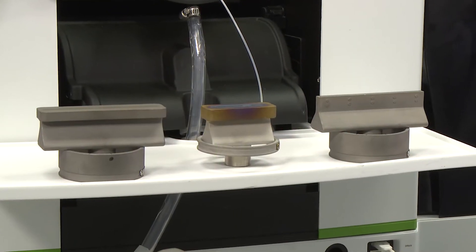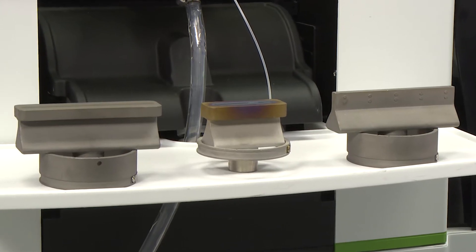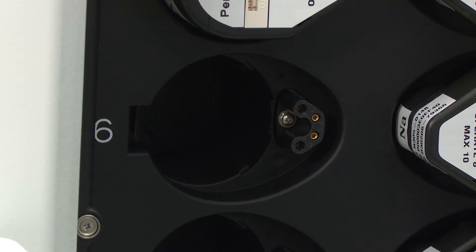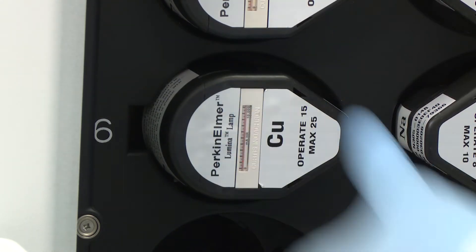First, make sure that the burner system is set up properly and the correct burner head for your intended analysis is installed. The next step in aligning the burner is to install and align the correct lamp for the element you have selected in the method.